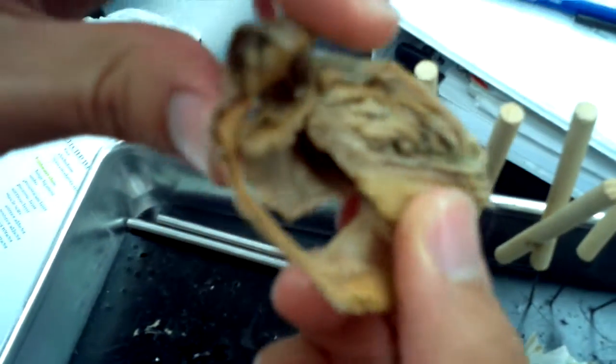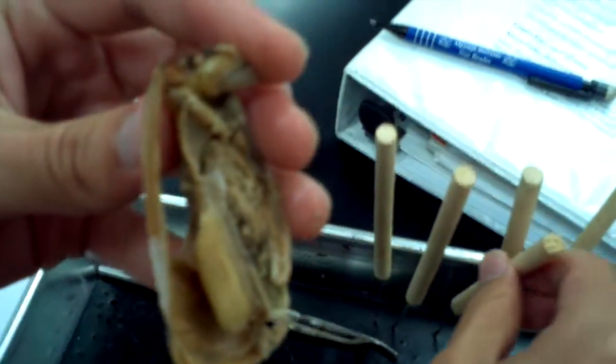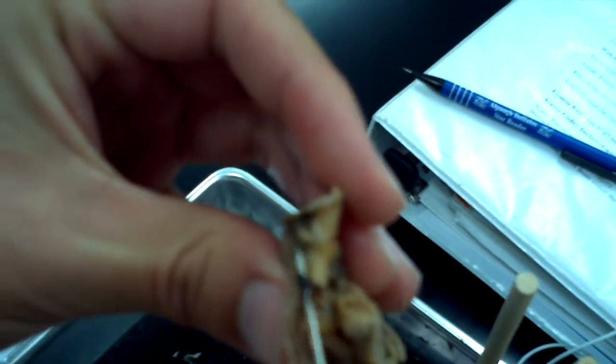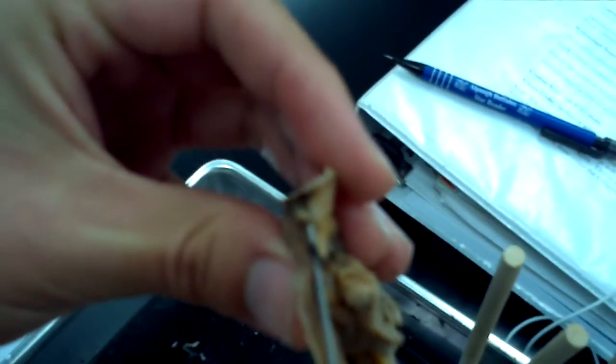Let's see the anus. Where's the anus? There is the anus — right there. Little thing sticking out. The anus.